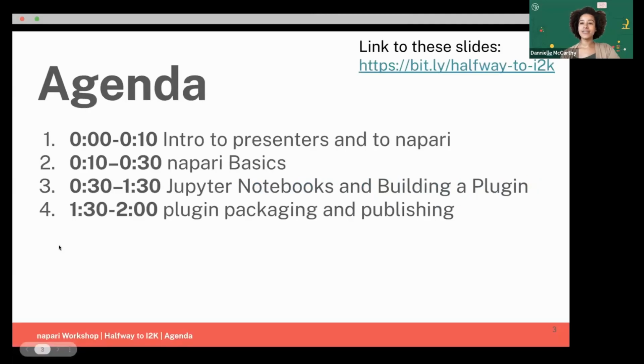As far as our agenda for today, we're going to start off with an introduction to presenters and to napari in this short slide deck. And then we'll be switching over to some napari basics, getting napari installed on all of y'all's machines and giving you some guidance on learning how to use the viewer. Then we'll spend the next hour focusing on using napari with Jupyter notebooks and wrap up with a talk about plugin packaging and publishing.